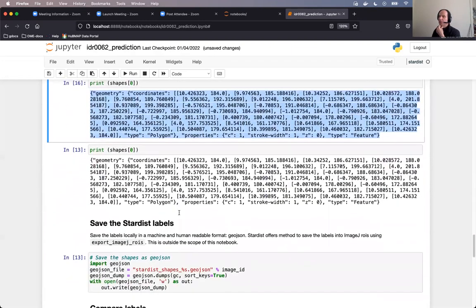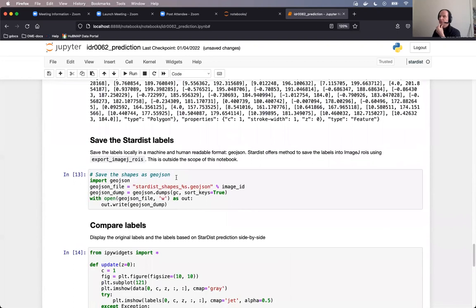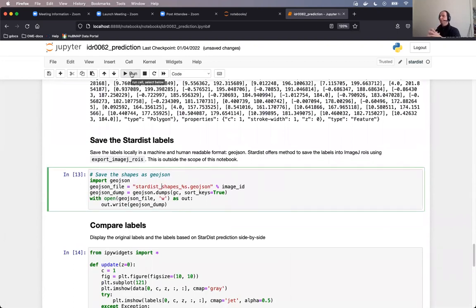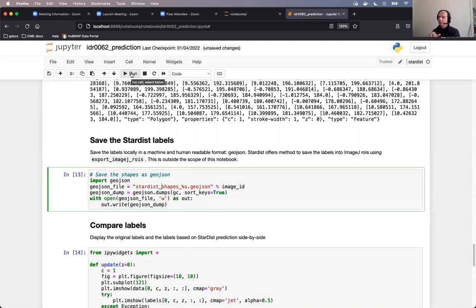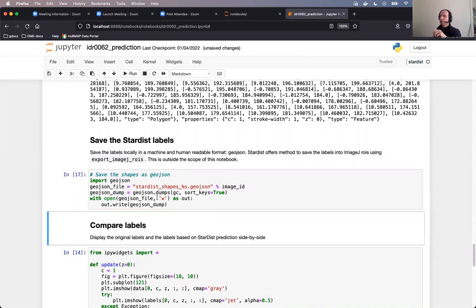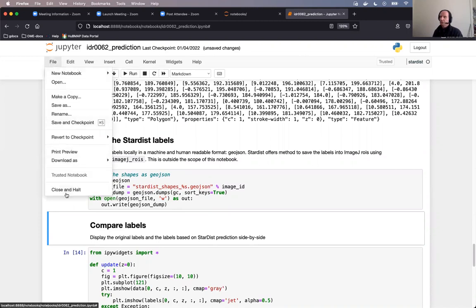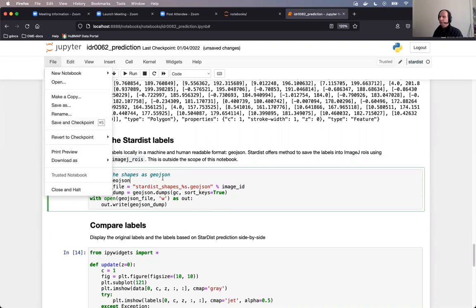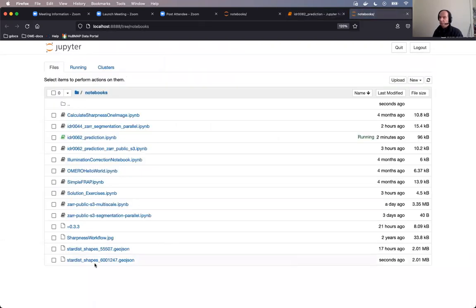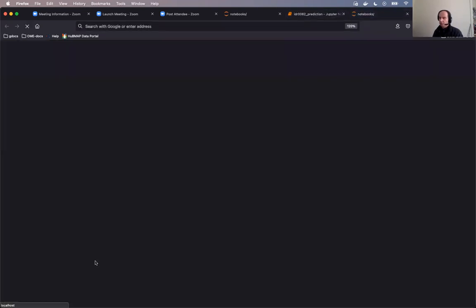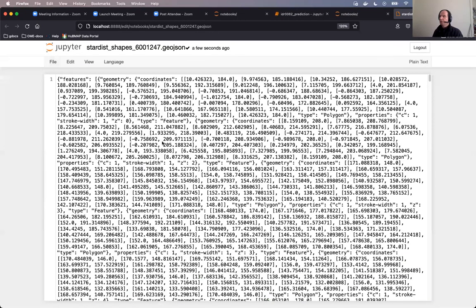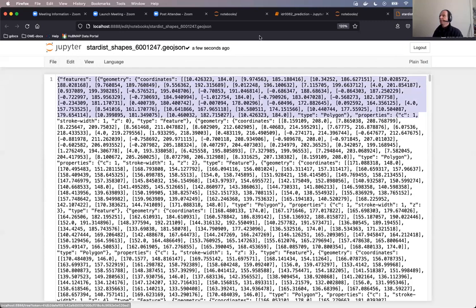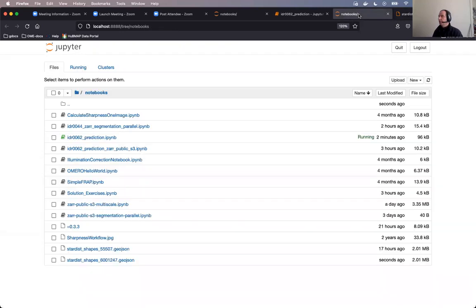We will then save these shapes as GeoJSON just to show you a way how to basically be more interoperable with your regions of interest with the results coming out of this notebook. And we will write the GeoJSON, which you might know is a human and machine readable format. And then we can see the GeoJSON in our notebook after we executed this cell. Basically, each paragraph inside the GeoJSON is corresponding to one segmented polygon shape.